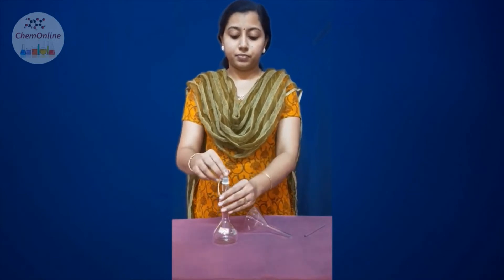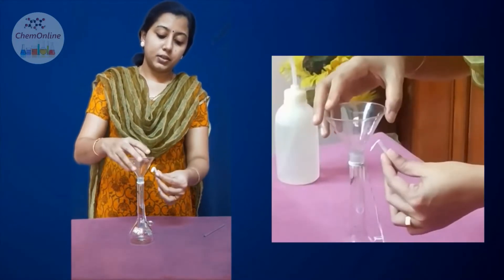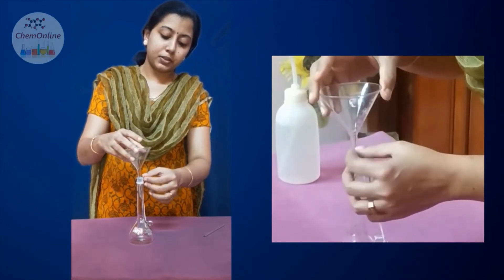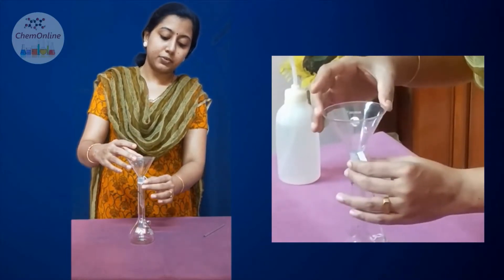Before starting, we have to wash all the glassware with distilled water. After washing, keep the funnel in place. Sometimes the air inside may push the solution upwards while transferring, so to avoid that, you can fold a paper and keep it along with the funnel. Be careful that the paper should not go inside the standard flask — keep it so that it fits correctly.